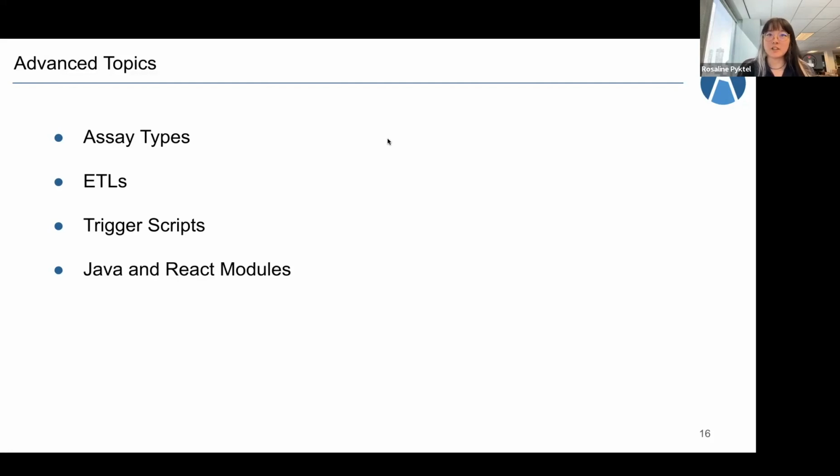React modules are modules that allow you to code with React. Using Gradle and Webpack, TypeScript, JavaScript, and style files are bundled and placed into the appropriate LabKey directory for web resources. The build also generates necessary LabKey HTML files alongside view.xml files. Hot reloading is supported. So you just have to save and see your changes reflected if you're running in the appropriate modes. So if you put these together into a Java React module, you can make calls in your React front end to custom API actions that you've written in the server-side Java layer if you want.